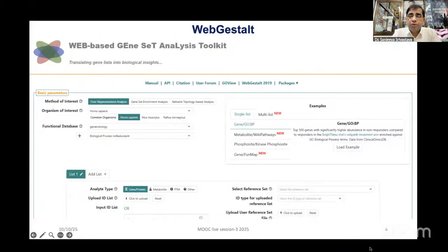All right. So there are different types of technology in NGS, which I'm sure you have already gone through. This is just one flavor of using targeted sequencing, using the Ion Torrent technology that we have.